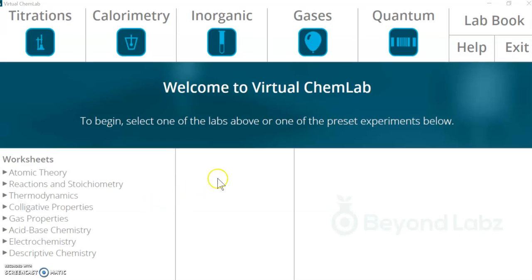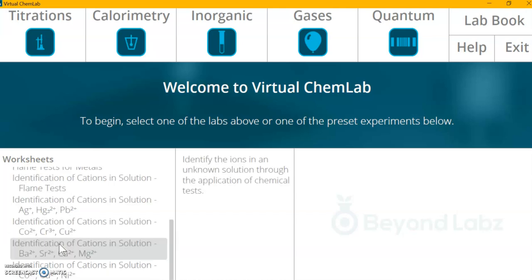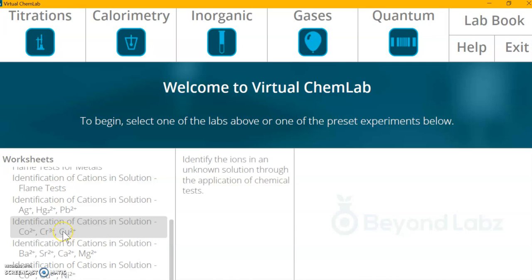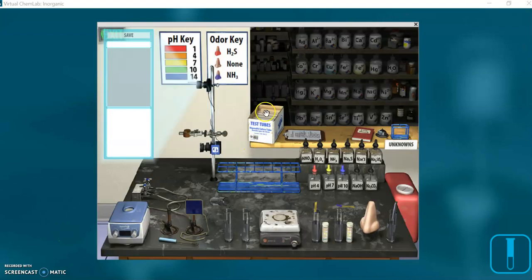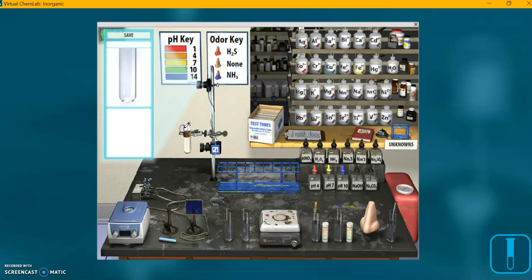I've already opened Beyond Labs and I'm here at the virtual chem lab. I'm going over to Descriptive Chemistry, scrolling down to look for the right lab. Cobalt, Chromium, Copper — this is it, so I'm opening it up. I'm going to grab a test tube and put it here in the metal test tube stand.